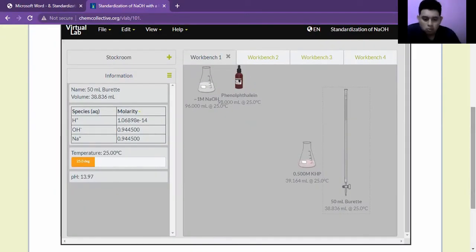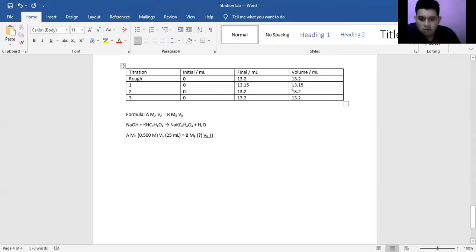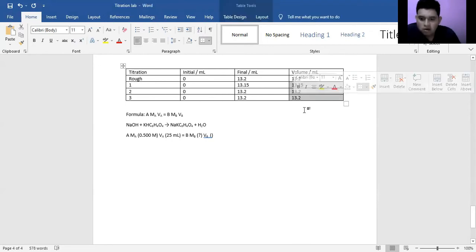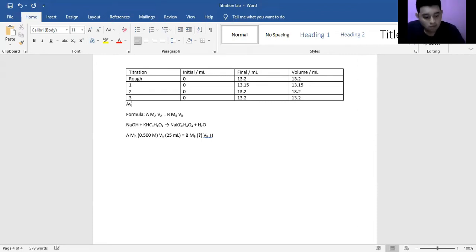Now it's time to do the calculation. The first thing that we want to do is to find the average volume based on the three trials. Therefore, we are going to add these three, 39.55 divided by 3, which is going to give us an average of 13.18.